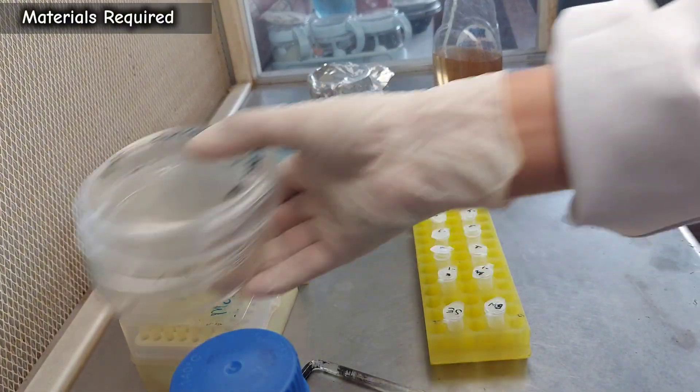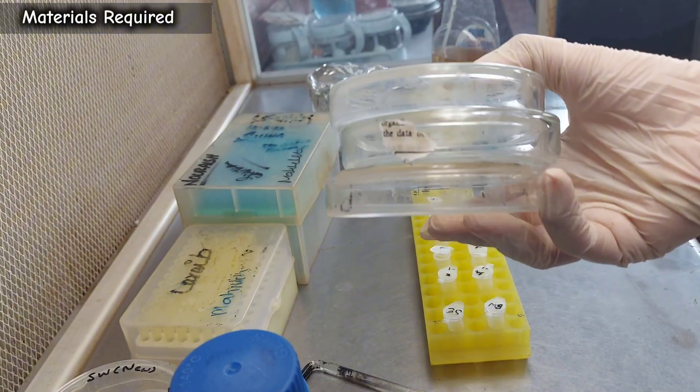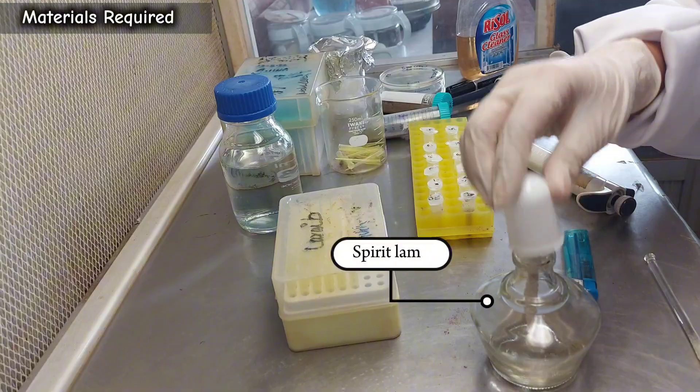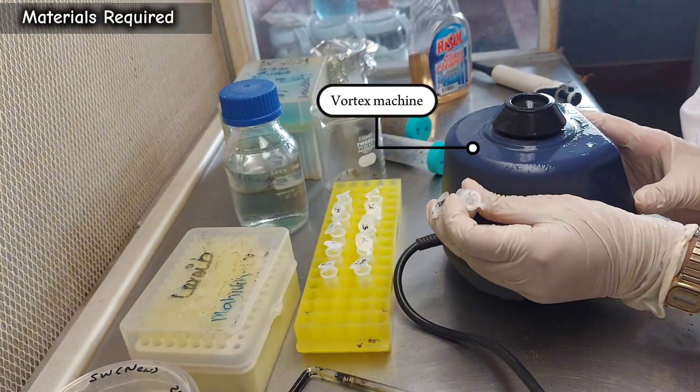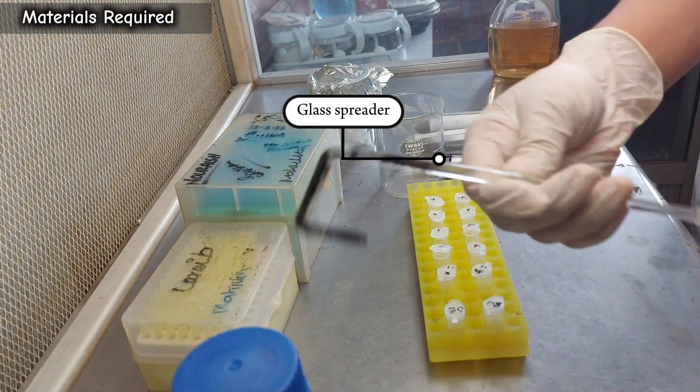Poured nutrient agar plates, a spirit lamp, a vortex machine, and a glass spreader.